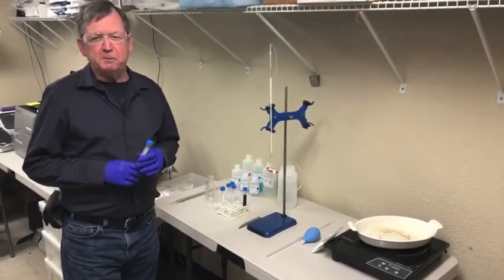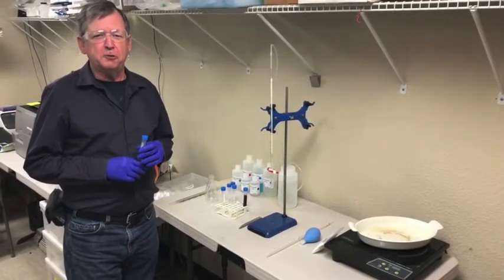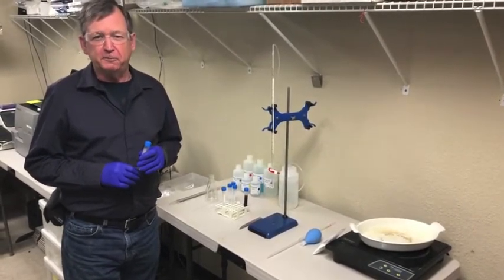Hi, I'm Rich Portzman with Vinmetrica. Today we're going to go through the new residual reducing sugar test from Vinmetrica.